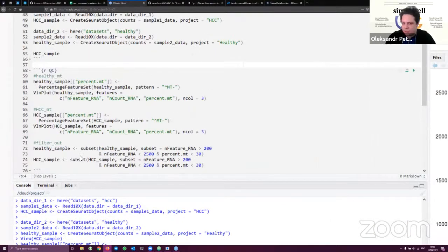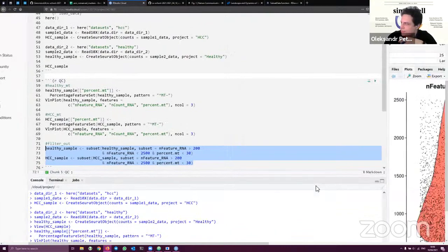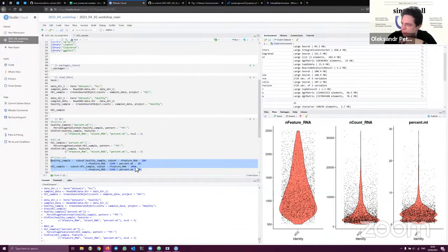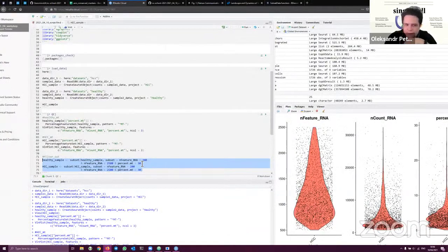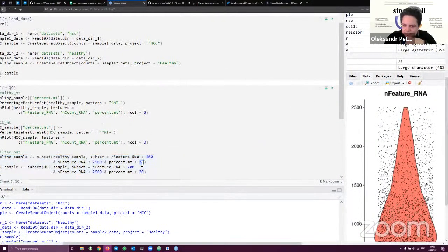And Alexander, can I ask you a question? Yes, please. So I was looking at the vignette for Seurat, and they consider 5% to be the mitochondrial content cutoff. Can you suggest what the cutoff should be when we are filtering or subsetting the data? So it's again always very tissue specific.